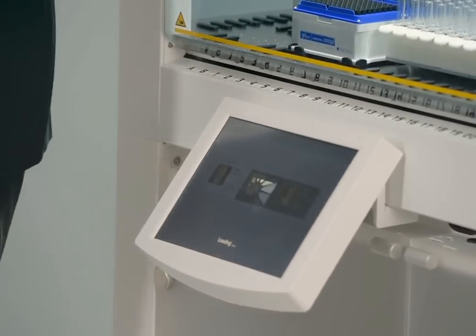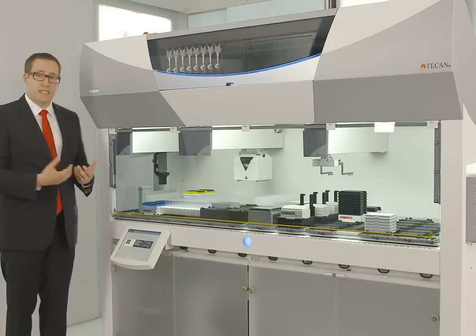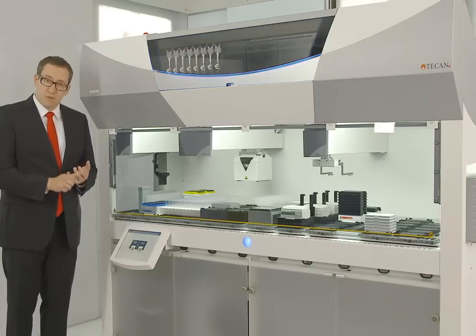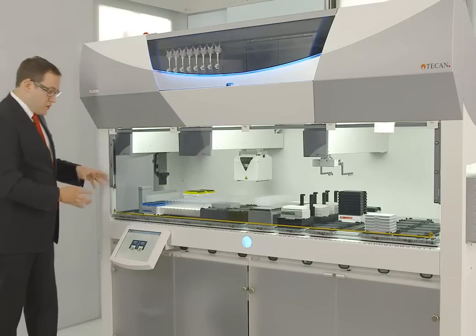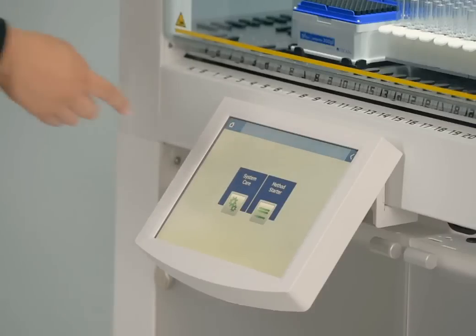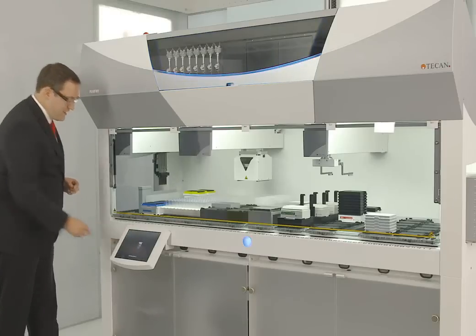Once you've logged in, you actually are given the things that you have permissions for. So now that I'm logged in, I'll have the access to the assays that I have the permissions to run, and my favorites will be set for me. And there are two primary functions I can do. There's system care and method starter. So let's just go right to the fun stuff, method starter. We'll start our first assay right here.